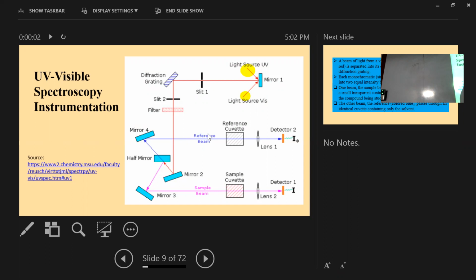If we have a small amount of sample, that will absorb a little amount of light, so it will transmit most of it. Now you can see it transmitted a little bit less compared to this one. If I go this way, the brightness of this light is more, but if I go through the sample, the thickness of this sample is a little bit less. Therefore, we can see some light.